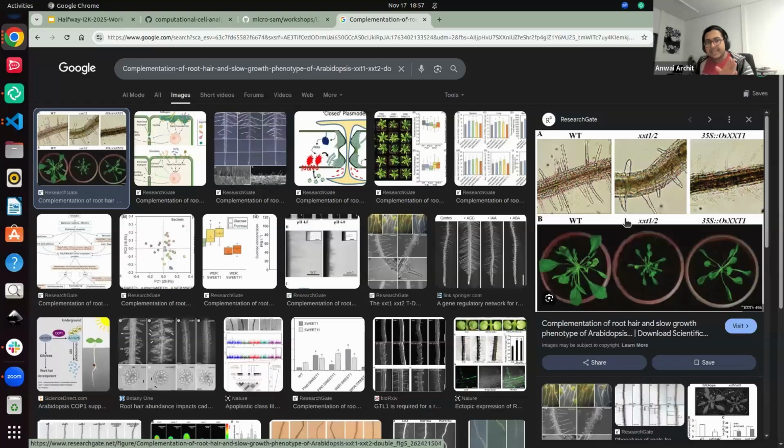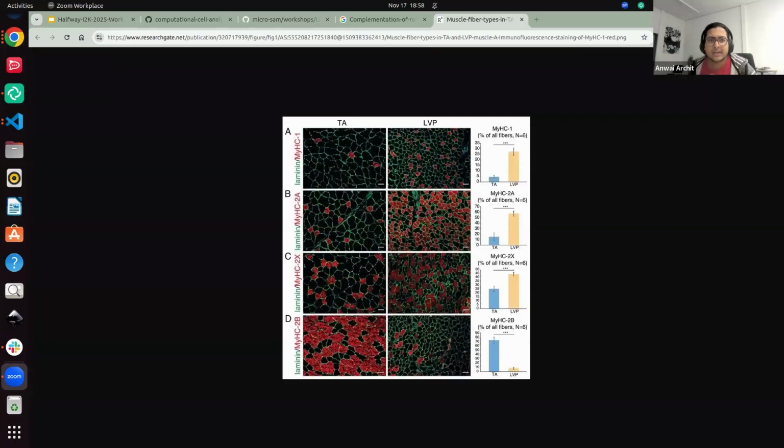As long as you have 10 densely annotated images, it goes in the direction of getting a good solution for your task. Because these models are aware of what they need to look for, but sometimes they're confused about what they should be looking for precisely. And that's where it comes from. Okay, Ricardo has another image. I hope that answers your question. Sorry, we quickly switched to the next question.